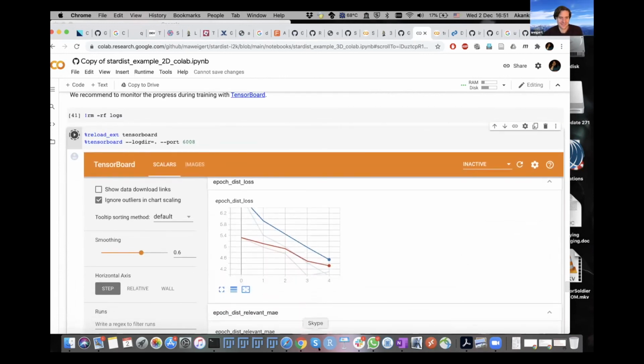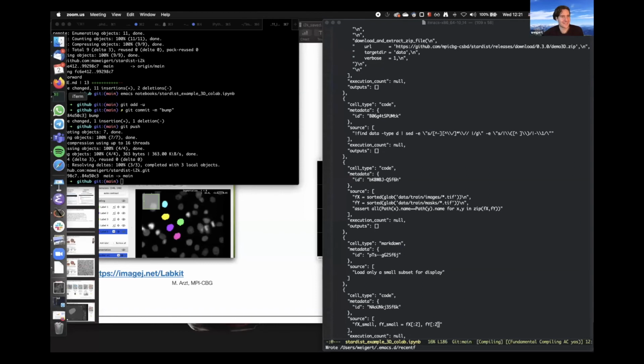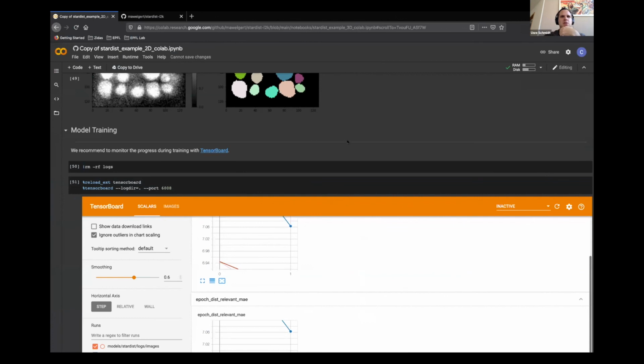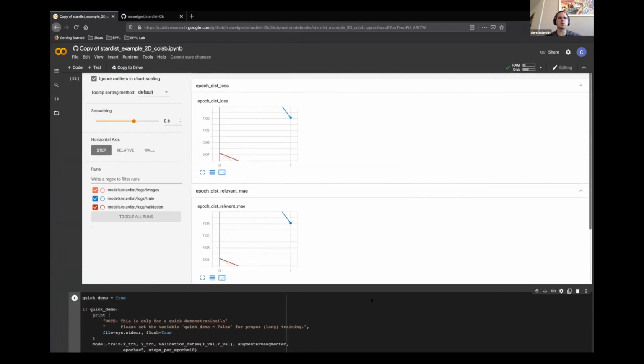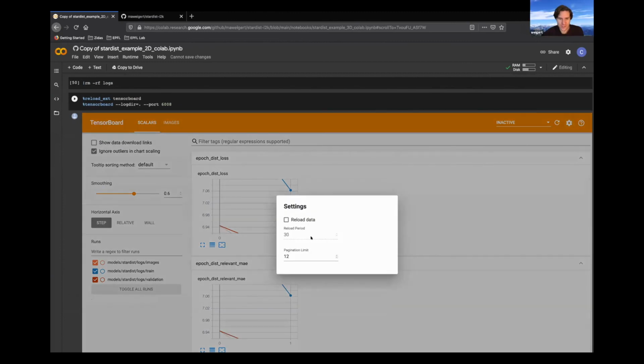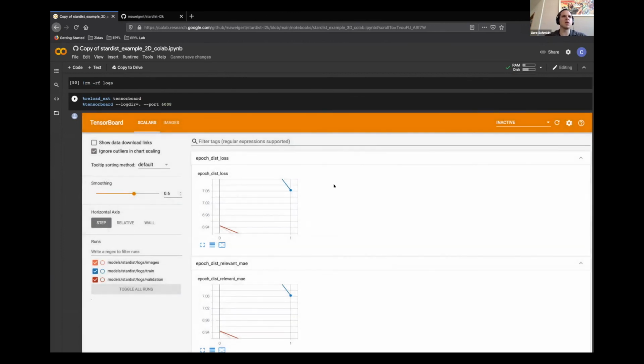Maybe there's a command line flag to automatically update. There's a way to automatically update every 15 seconds, I think that's the smallest interval you can choose. When you hit the little gear icon, there's an auto update. Maybe you can actually do this in a command line so you don't have to hit that button every time you want to see updates. It should already do that every 30 seconds, but the default is that it's not on, which is stupid, but whatever.